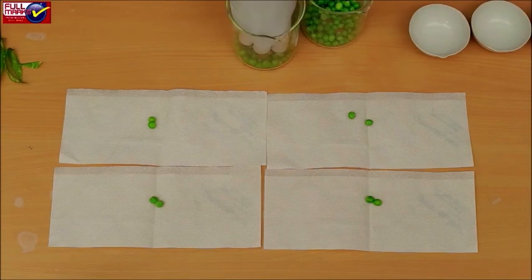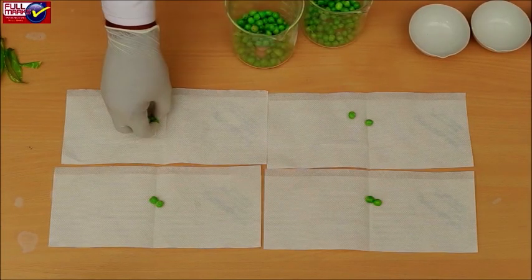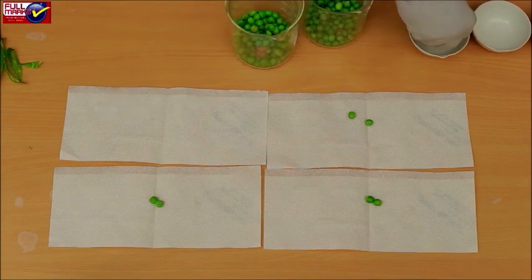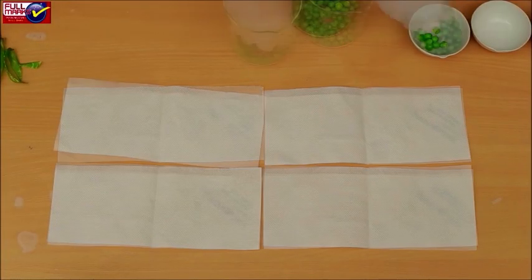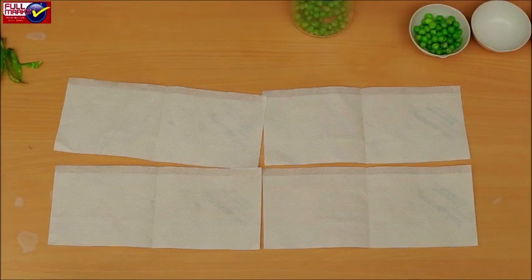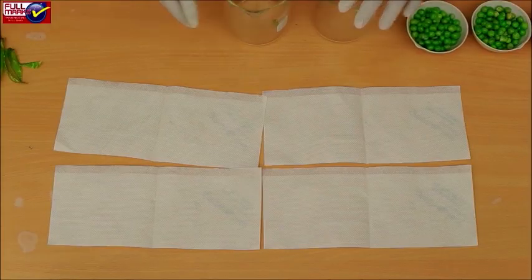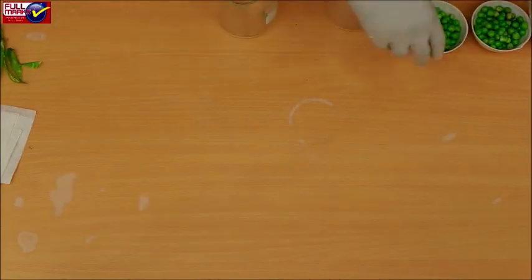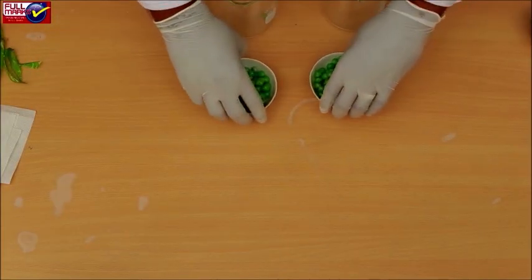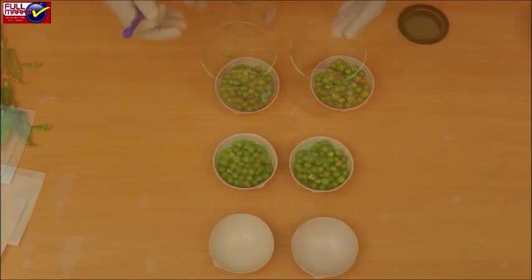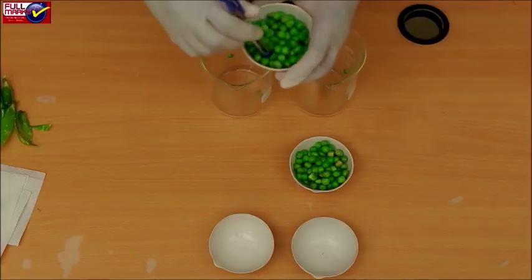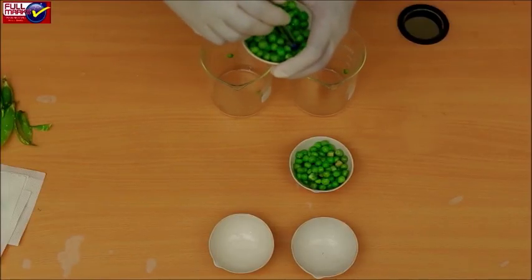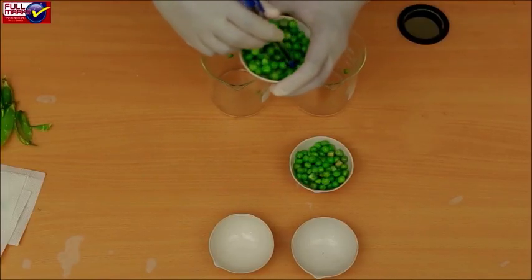Put 32 F1 progeny in one petri dish and the remaining 32 in another petri dish representing the F1 males and females. Stir the seeds of each petri dish with a pencil or pen about 10 times, taking care that no seeds fall off.